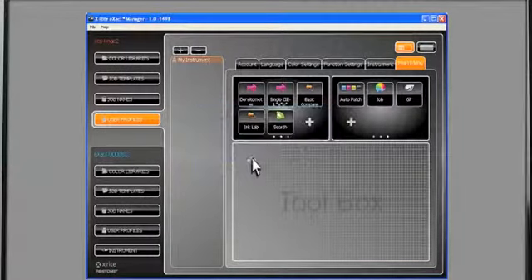To remove an item from the menu screen, it can either be dragged to the toolbox or completely removed by right-clicking and deleting it. Double-clicking on a tool will allow you to configure it. Clicking on the text for a tool will allow you to rename it. Finally, tools may be shared with other users by importing or exporting.